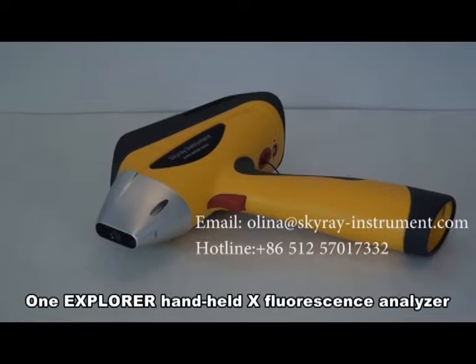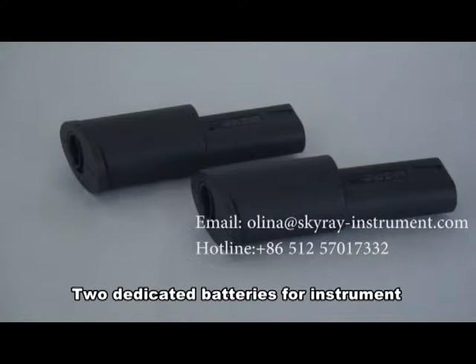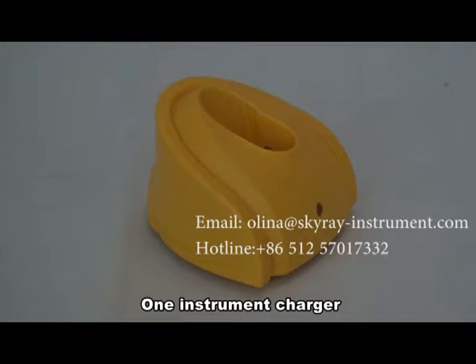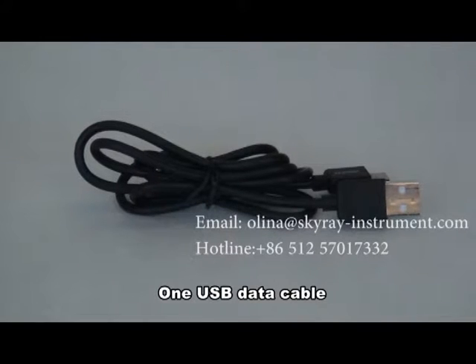First, one Explorer handheld X fluorescence analyzer. Second, two dedicated batteries for the instrument. Third, one instrument charger. Fourth, one onboard card charger. Fifth, one USB data cable.